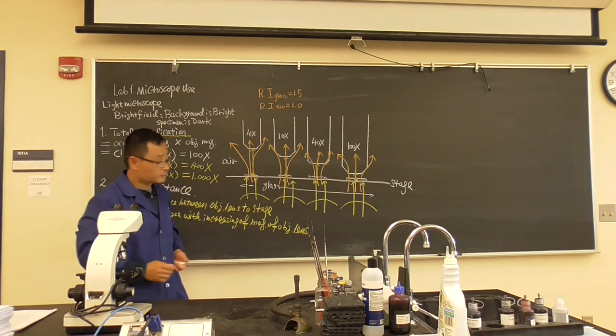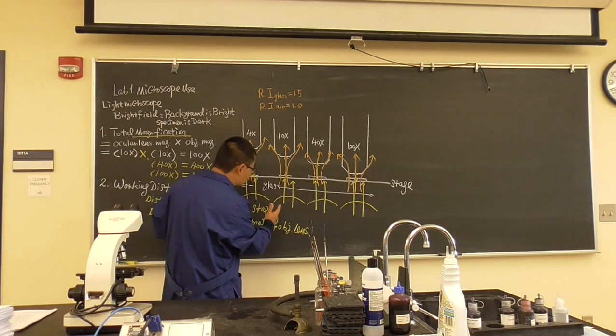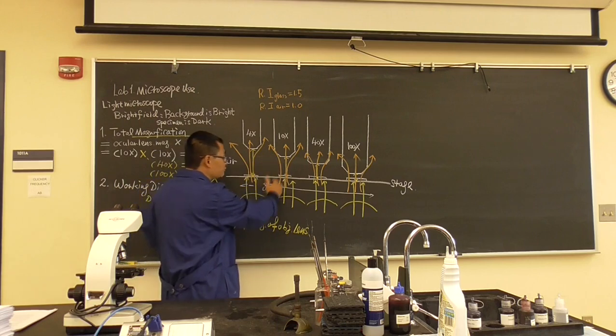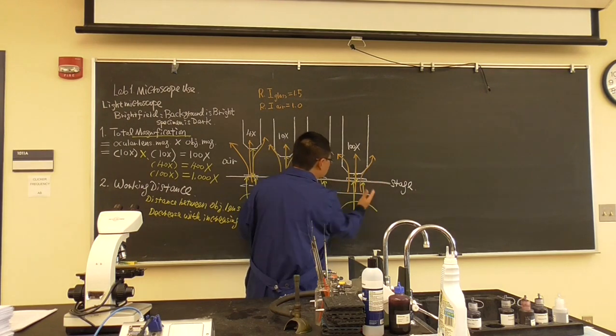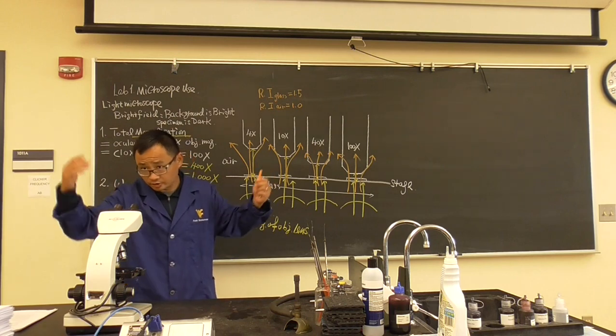This is obvious when you are using a microscope. For example, use 4x, you find a sample. Then you turn to 10x, it looks a little bit larger, but it's unclear. Then you go to 40x, it's more unclear. When you go to 100x, it's completely fuzzy because the refraction is enlarged.